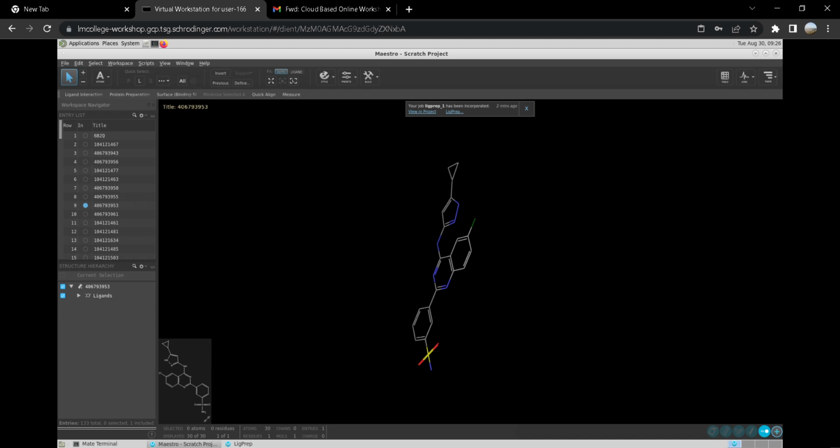We took molecules, and then we prepared the protein, which is 6B2Q, and then Prajal showed you how to prepare it, and then set it up for grid generation, and then he imported around 36 molecules and performed LigPrep for the same. You could see here the default launch will generate around 96 because of the stereoisomers, ionization states, and other information. So this is what the output looks like, and you can see the 3D structures, and you will be able to visualize the same in 2D in this 2D viewer also. So you can see all the structures.